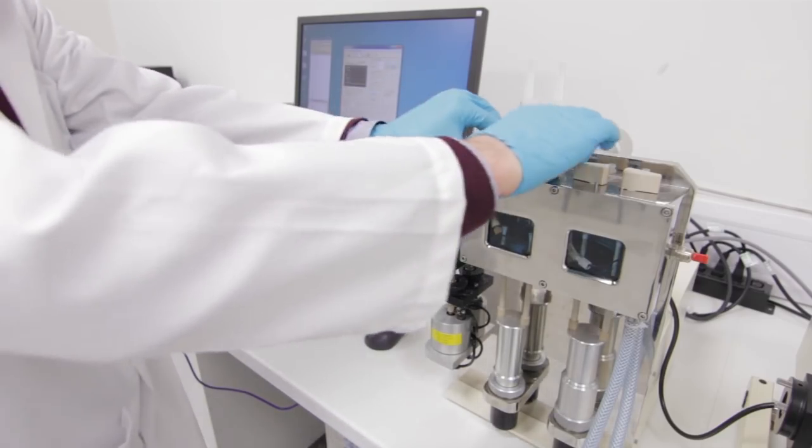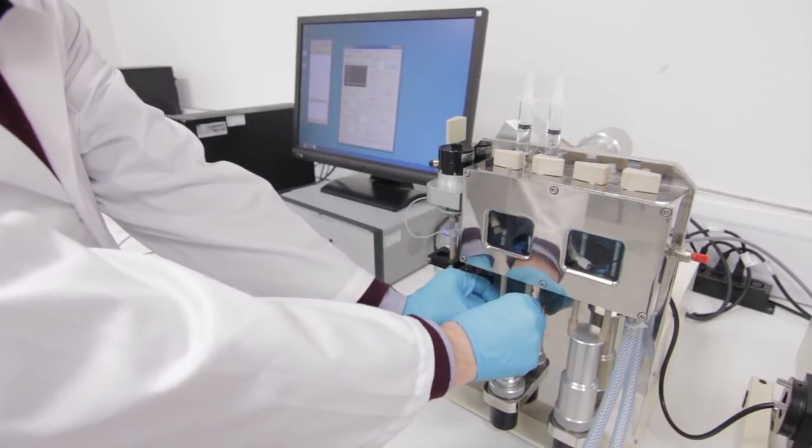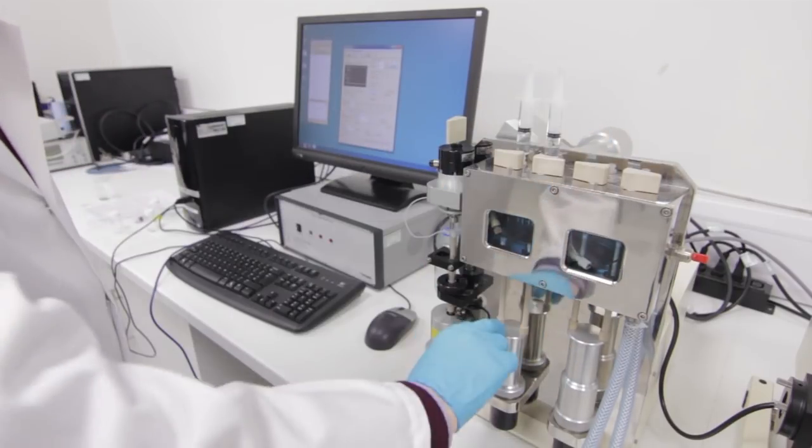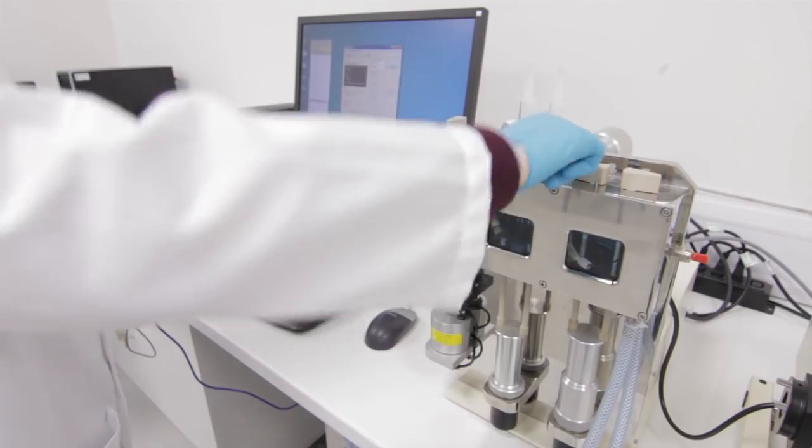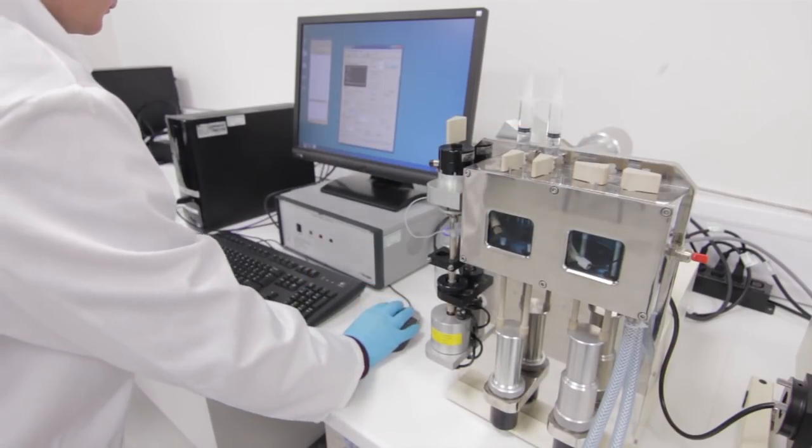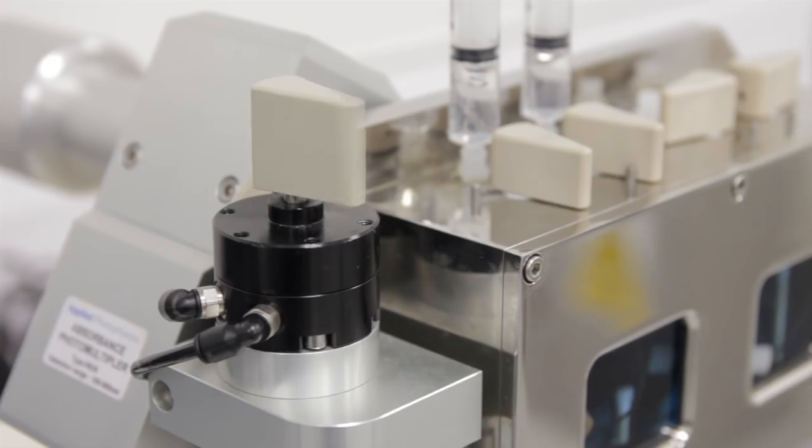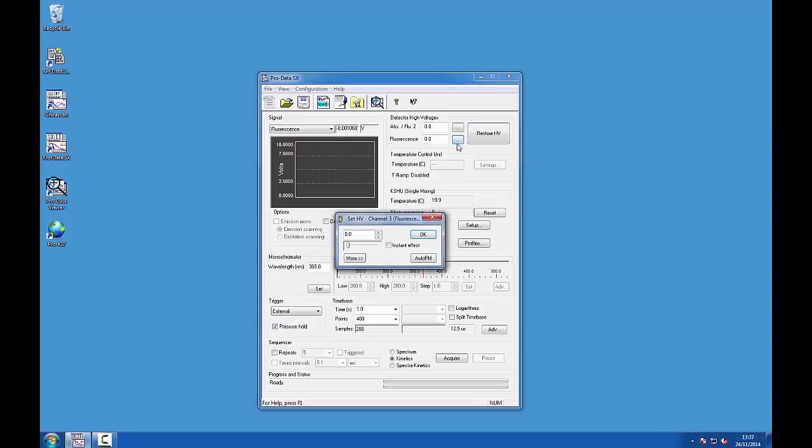To fill the cell, load the drive syringes, again ensure bubbles aren't introduced, and set the drive valves to the drive position. Click the drive button several times to fill the cell, and click the button next to the fluorescence box on the detector high voltages panel and click auto PM in the dialog box to set the high voltage.